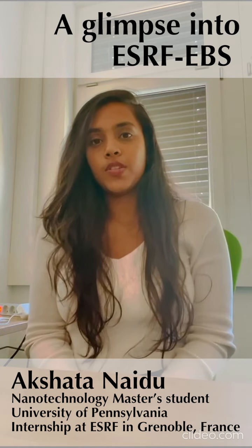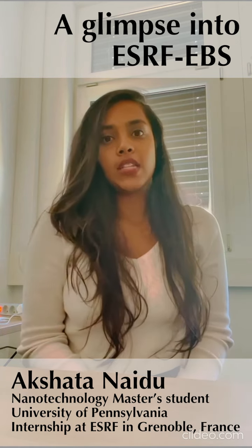I am doing my master's in nanotechnology, and I am here at the ESRF, which is the European Synchrotron Radiation Facility, to carry out my research, which includes imaging of platinum nanoparticles using the BCDI technique, which is the Bragg coherent diffractive imaging technique. And I will be explaining to you how the synchrotron works, what are the instrumentations that go into the system, as well as the data analysis part.